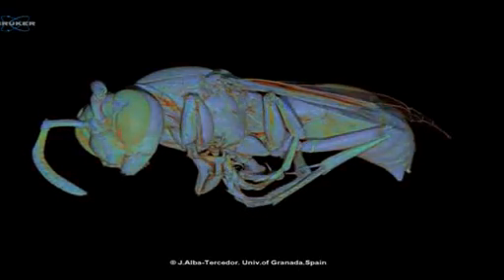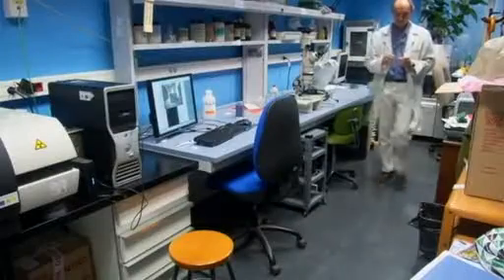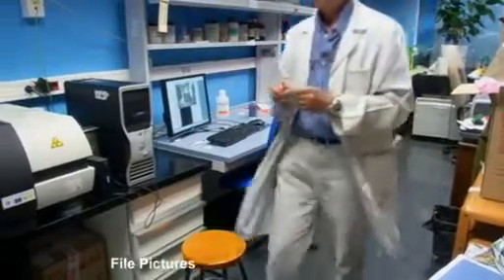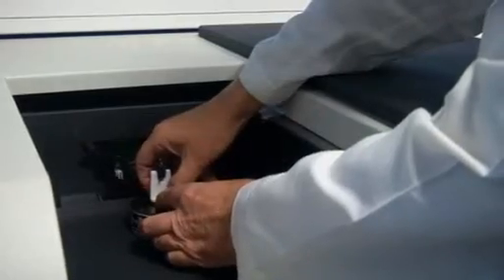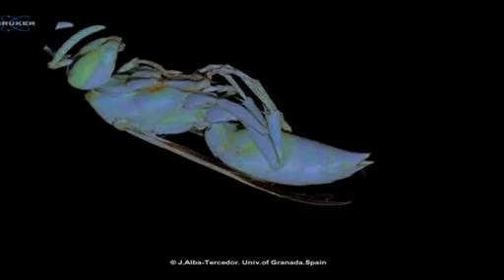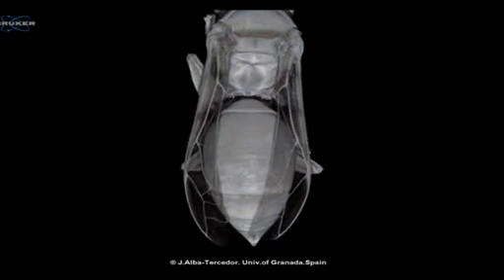Until recently, studying organisms this small involved microscopes and dissection. But zoology professor Javier Alba-Tercedor from the University of Granada has mastered a technique using microtomography, a non-invasive method where a rotating scanner takes X-ray photographs of an insect. By combining hundreds of these photographs, a complete picture can be produced in unprecedented detail.